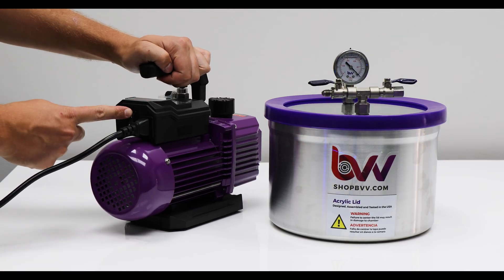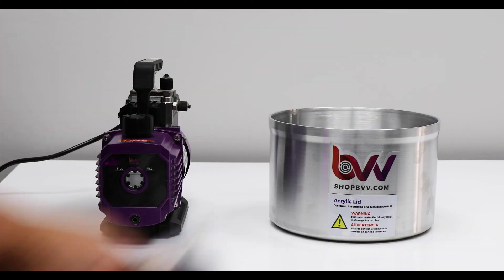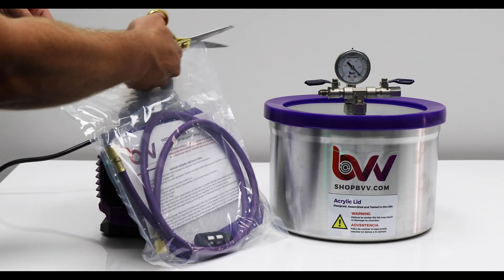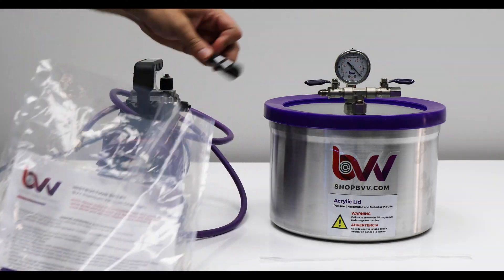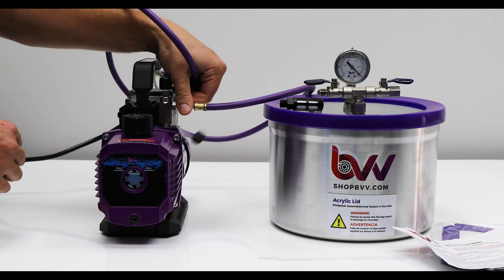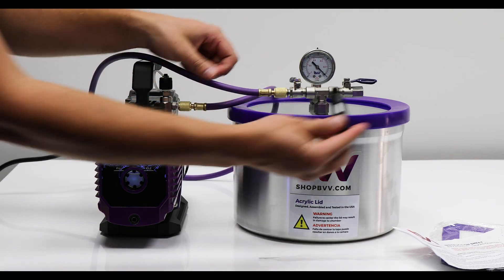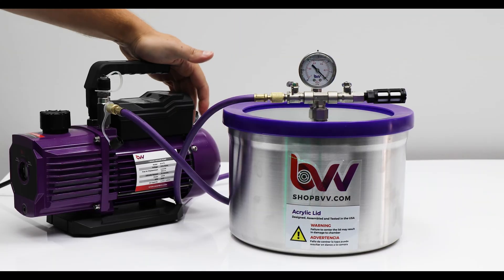Plug in your vacuum pump and give it a quick test. Take everything out of your chamber. You're going to get everything included here: a hose, a filter, paperwork, and a silicone pad. Attach the vacuum hose to the vacuum pump and to the vacuum chamber. Both of these will be quarter inch JIC connections. Put your filter on the end of the vacuum chamber.